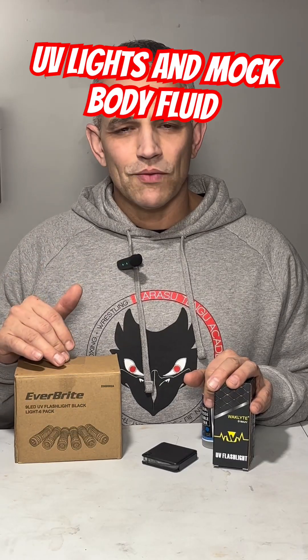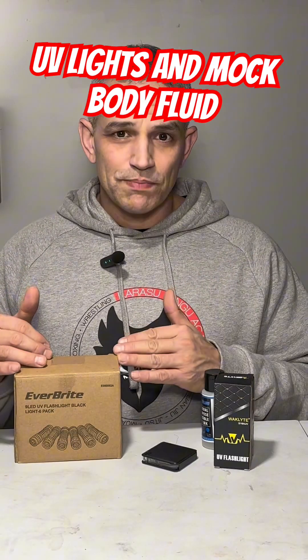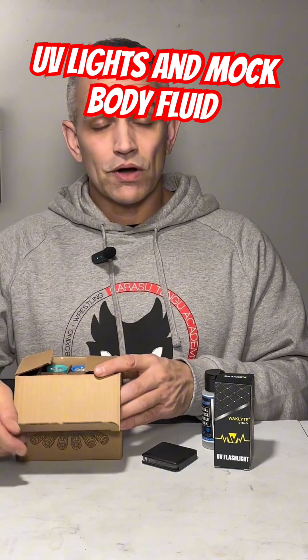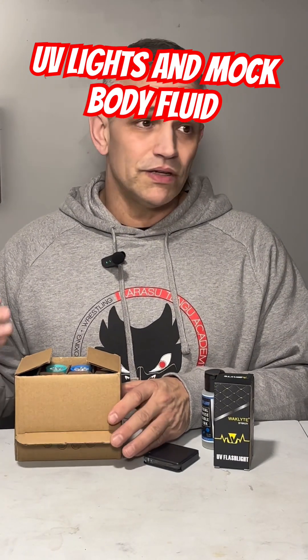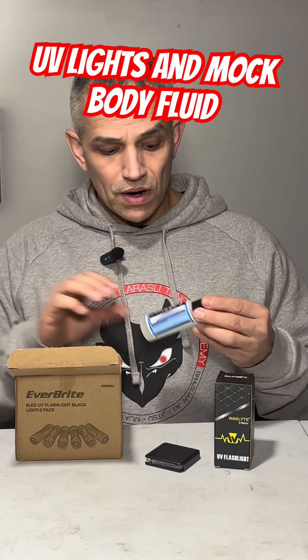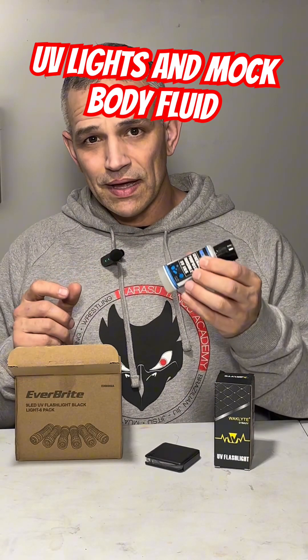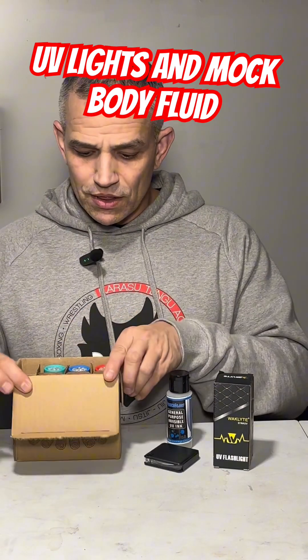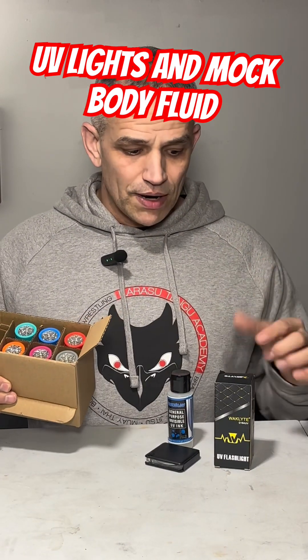Hey everyone, I got a couple things I want to show you. These are inexpensive ultraviolet lights that I got off of Amazon. They work really good for mock crime scenes, for students looking at fluorescent powders, or what I use is a UV ink to simulate bodily fluids. Let me show you in the box first and then I'll show you how bright they are.